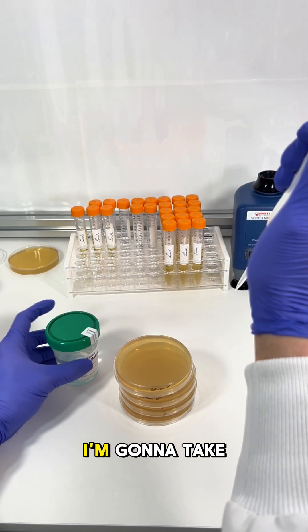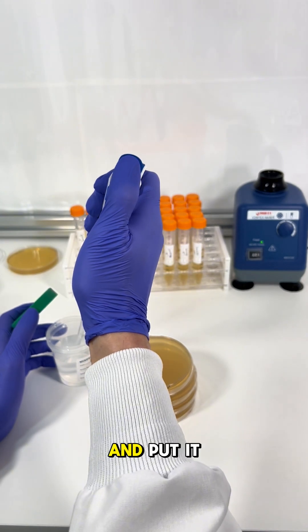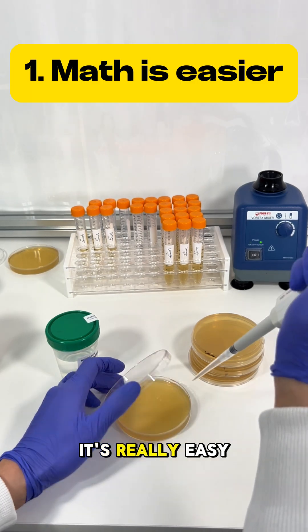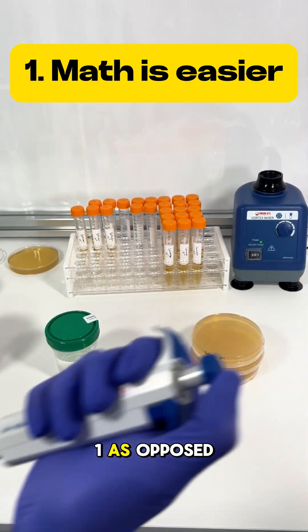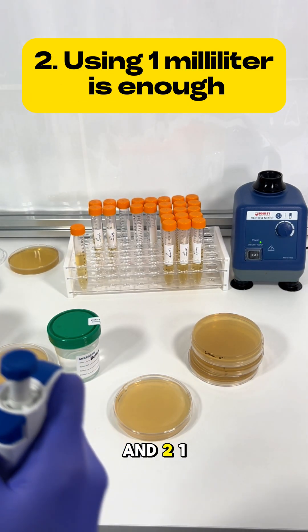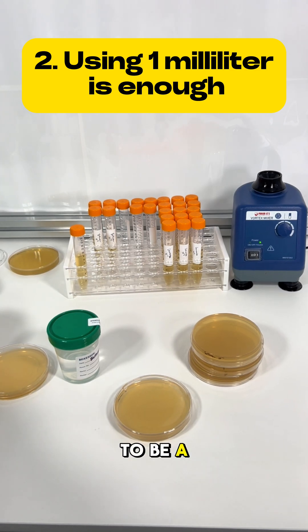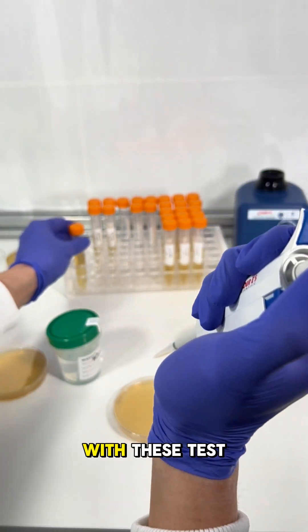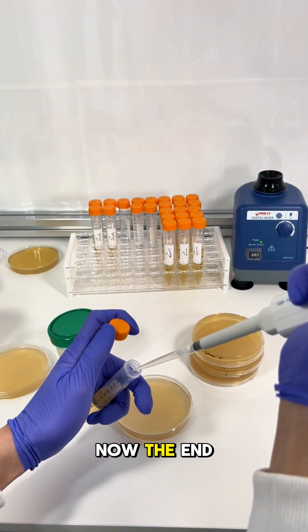To test the water, I'm taking one milliliter of water and putting it onto a tryptic soy agar plate. The reason it's just one milliliter is: first, it's easy to do math with the number one as opposed to two or three; and second, one milliliter has been determined to be a sufficient volume for this testing process. Next, I'm going to make some dilutions with these test tubes.